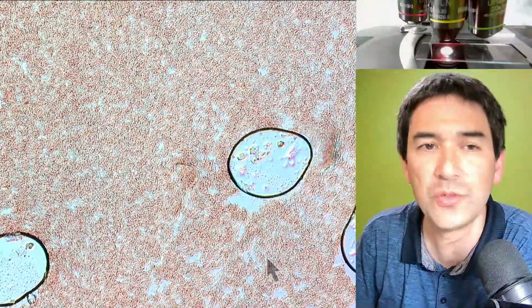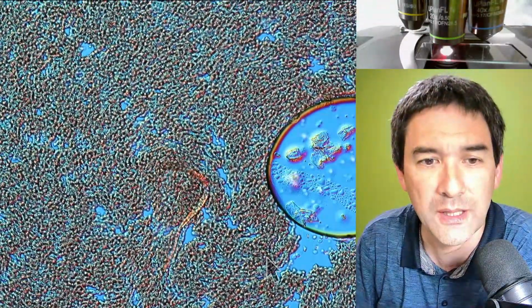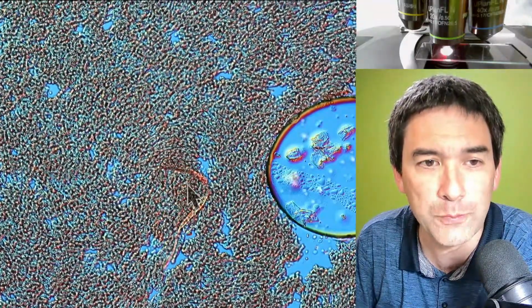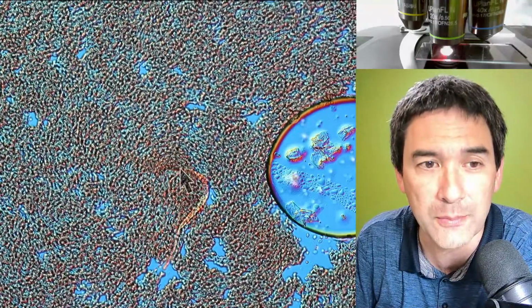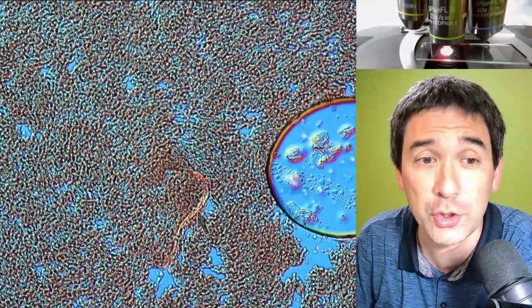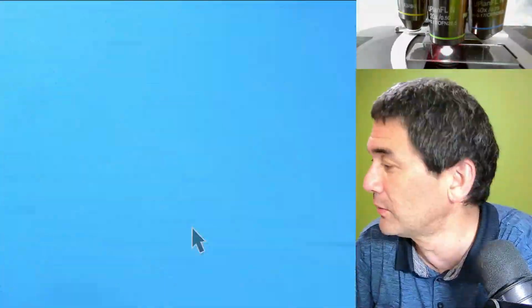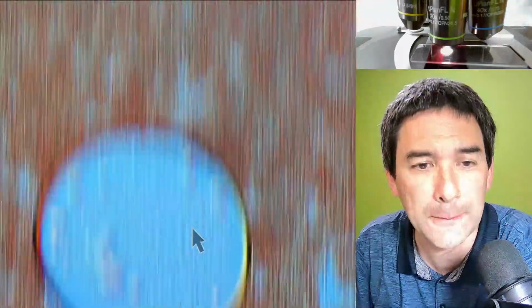Yeah, and what we see is that the blood is now, due to capillary action, starting to spread. Again, you will see some fibers. The reason is I cleaned the cover glass and the microscope slide with some tissue paper, so these are probably some cellulose fibers of the tissue paper. So we just ignore these things. And the density is quite high, but where is this? Here the blood did not go yet. But it's slowly spreading.